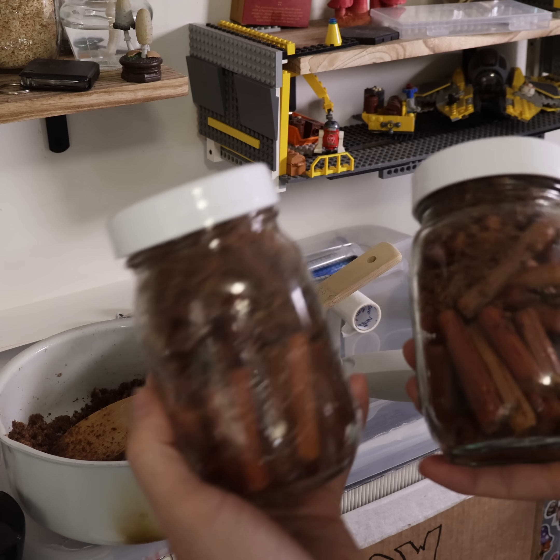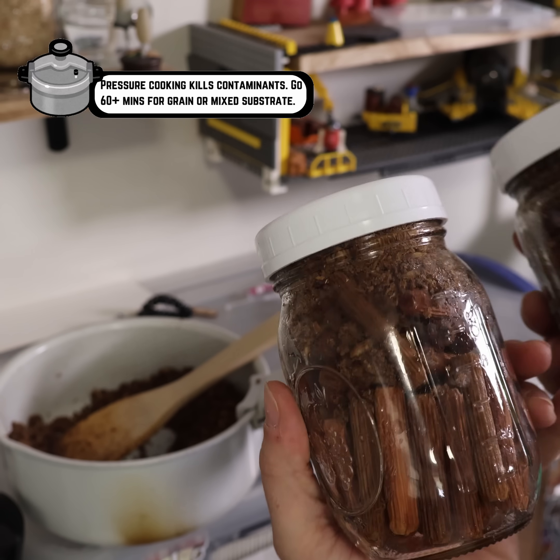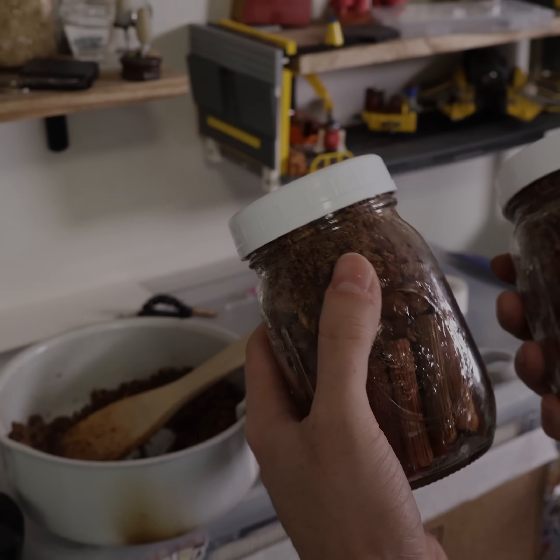Now we can go cover these with aluminum foil and pressure cook. I'm going to send them probably for at least an hour just to be safe, especially because of those oats that I have in the top.